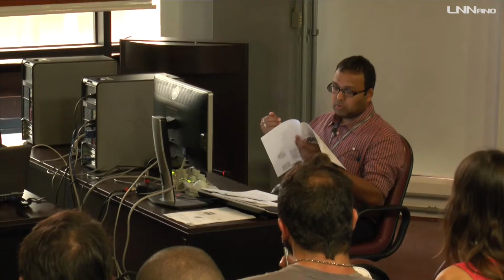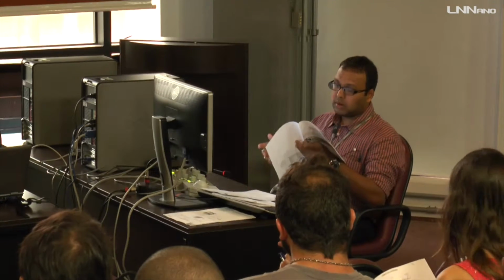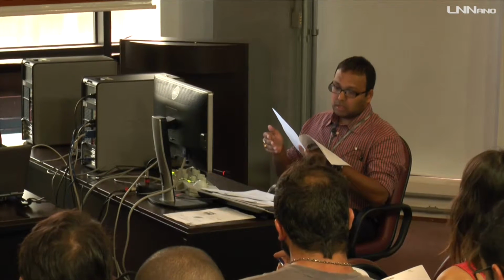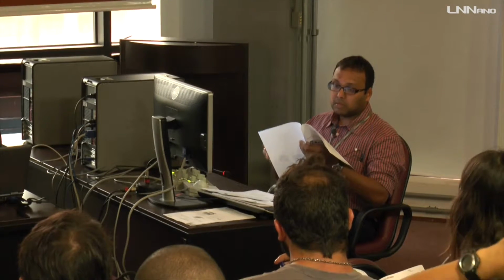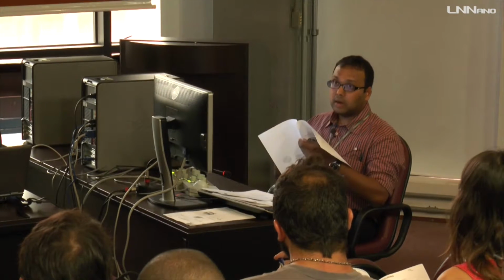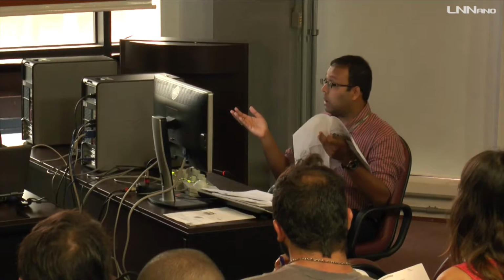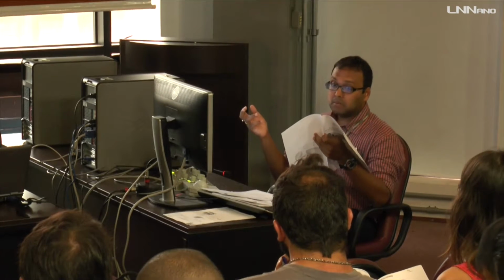And of course, in the last slide, I mentioned that this is to be continued on 18/01, that's on Monday. Monday's talk is going to be a CBD exclusive talk. In that talk, I'll be using the diffraction patterns that are acquired in this session. And of course, from using one sample, I can't get all the different types of CBD patterns. Here, I will try to show you what different patterns I can get.